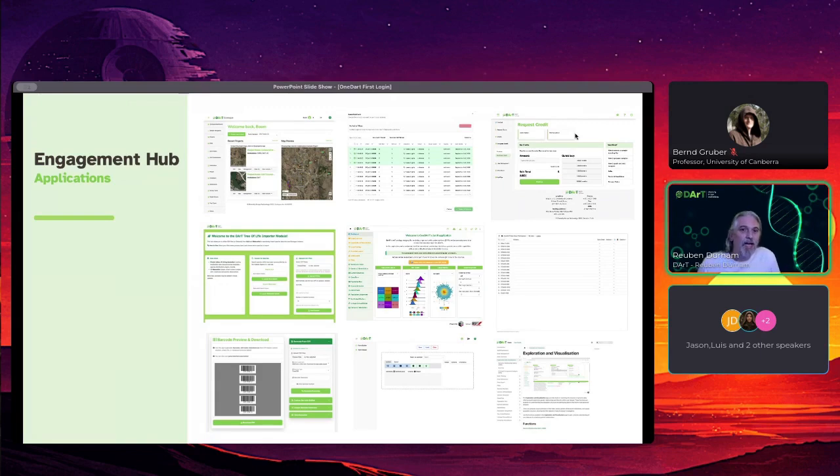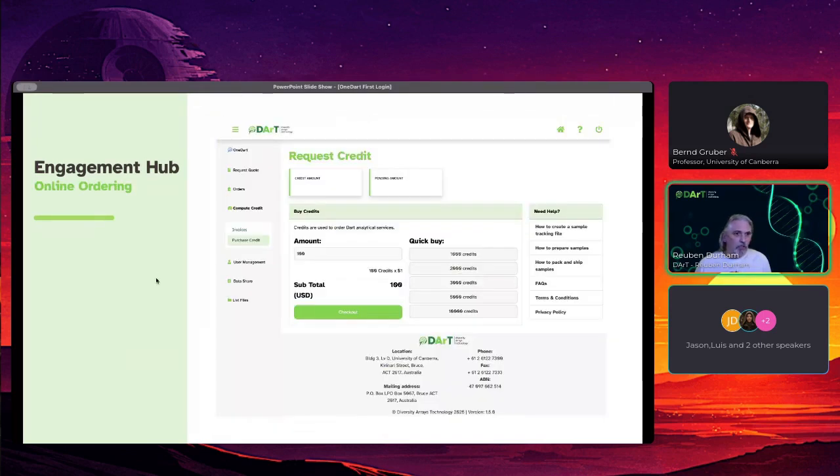In the top right, we have the online ordering portal, and I'll go to that just to show the compute credit. That's where we'd go to request more compute credits. So our $1 of compute credit would give most of a day of experimentation. But if you're doing some serious analysis and are going to be leaving things running for a while, you'll need a little more than that.